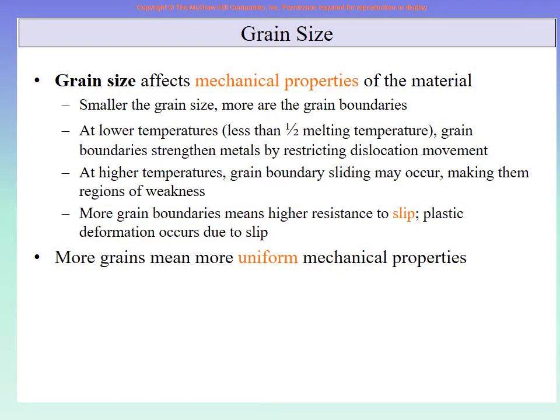So now you see this has been done. You have prepared the sample, you have done it, you have taken the pictures. Now in our lab, the microscope is a very costly microscope. We bought it several years ago for about 40,000 reals plus. It's a very costly microscope.